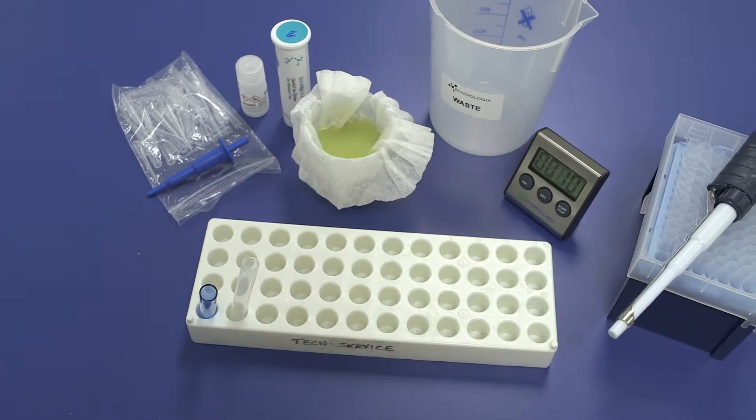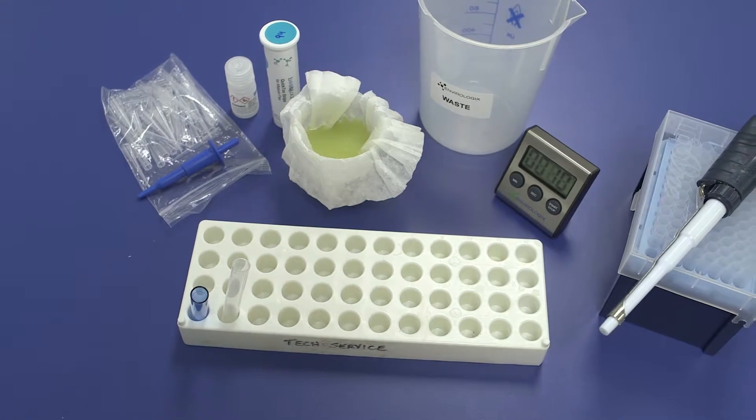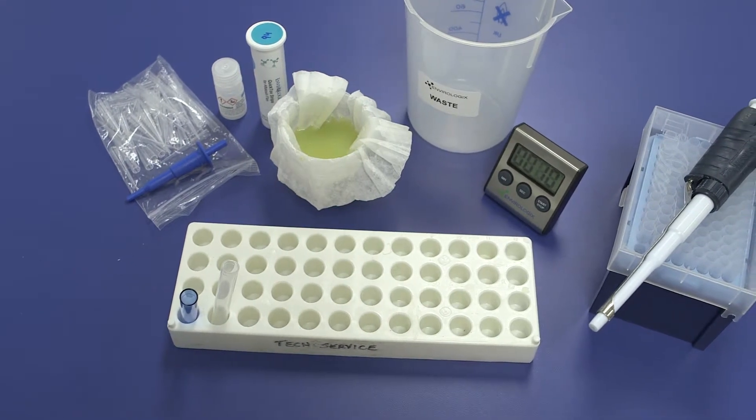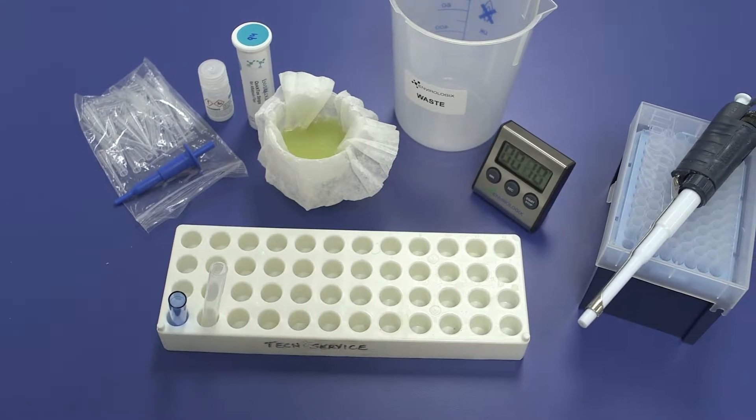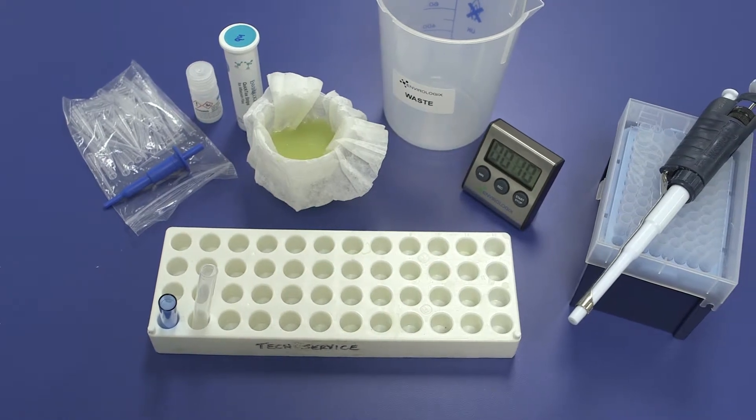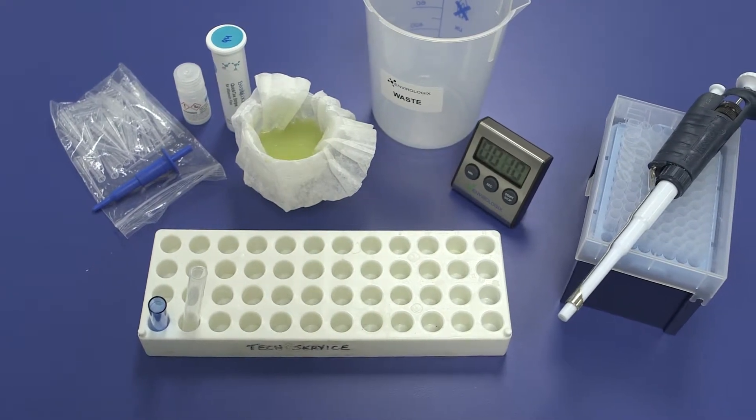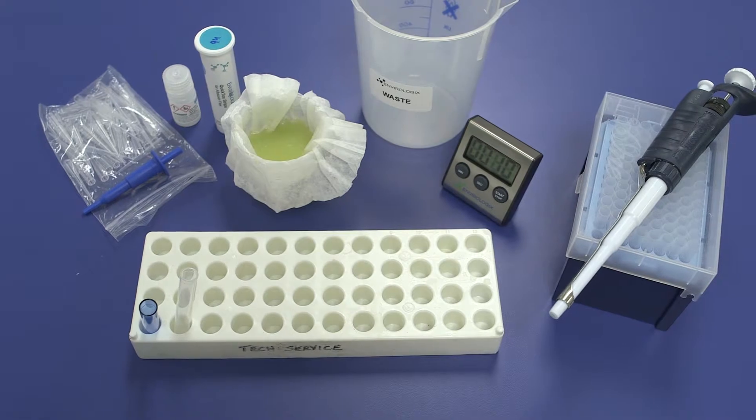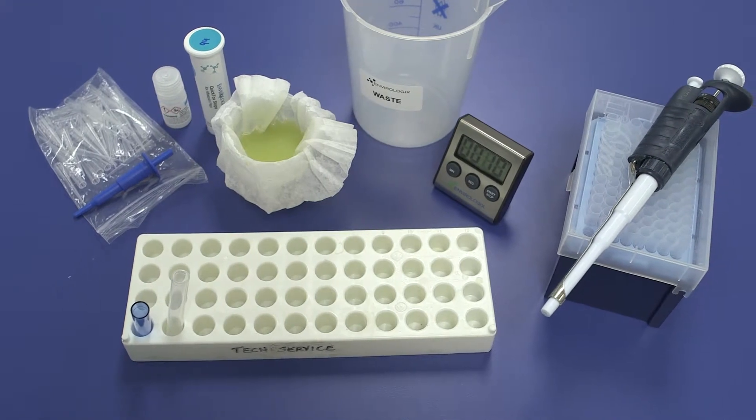Extra tubes and EB-17 pouches are needed when running dilutions. For optimal accuracy, we recommend using a 1-milliliter adjustable pipette for dilution preparation.